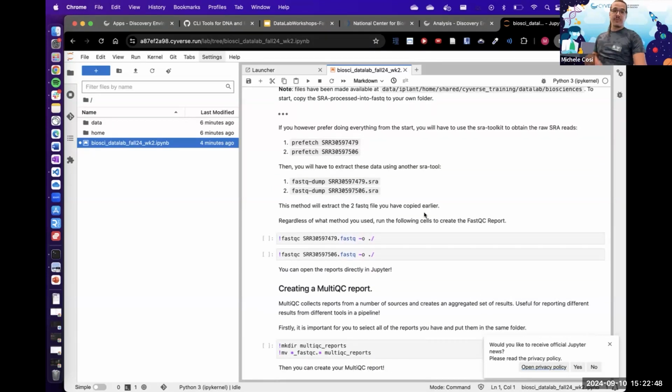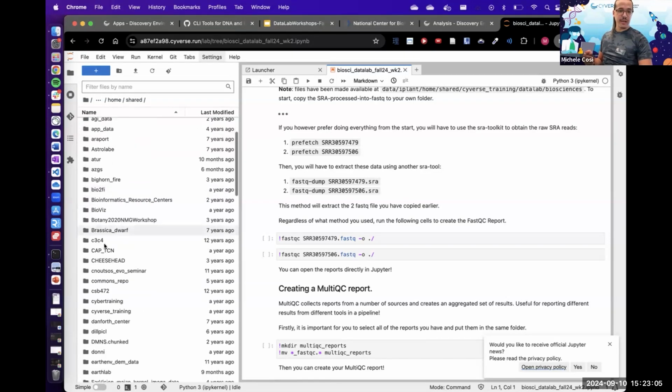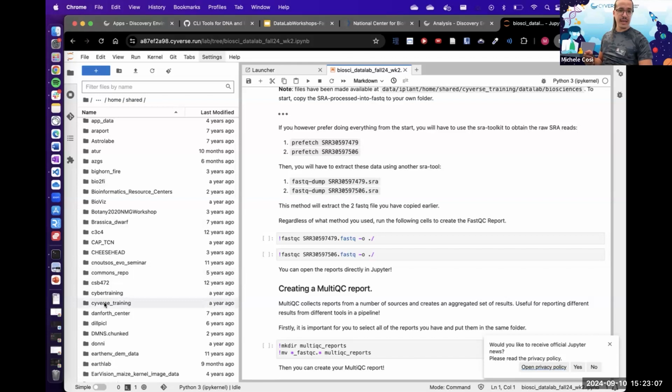Now, you can go ahead and run FastQC on some of the files that you want, but ideally I would like to see FastQC reports right now. So I'm just going to go to the ones that I have already produced, and you can go there yourself as well. So once again, data shared.